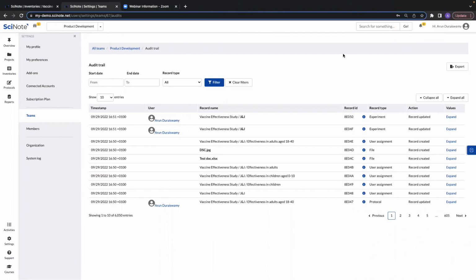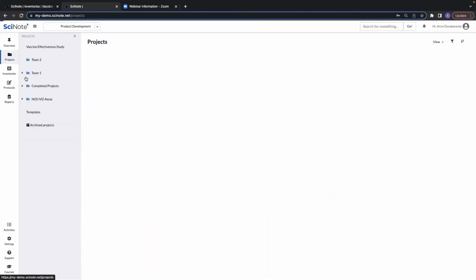All right. Another question here I have is, if I decide to add all members to the project in the future, do I have to add them all individually, or is there a button to add them all at once like you do when you create the project?